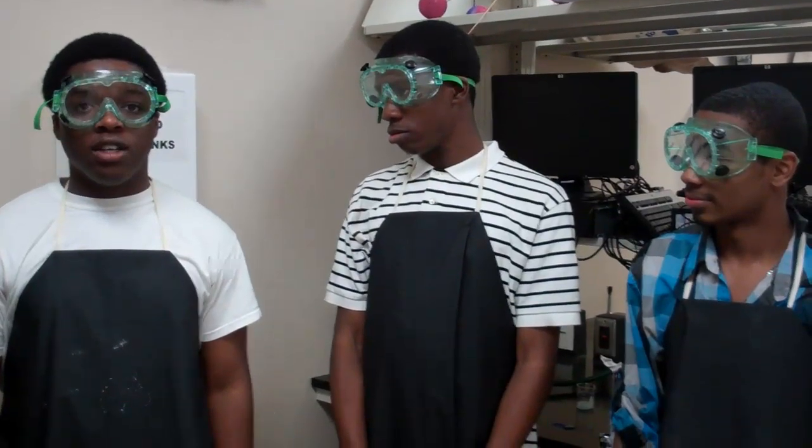Today we'll be doing the flame test for calcium nitrate. Calcium nitrate is a colorless salt that absorbs moisture and is found in fertilizer.